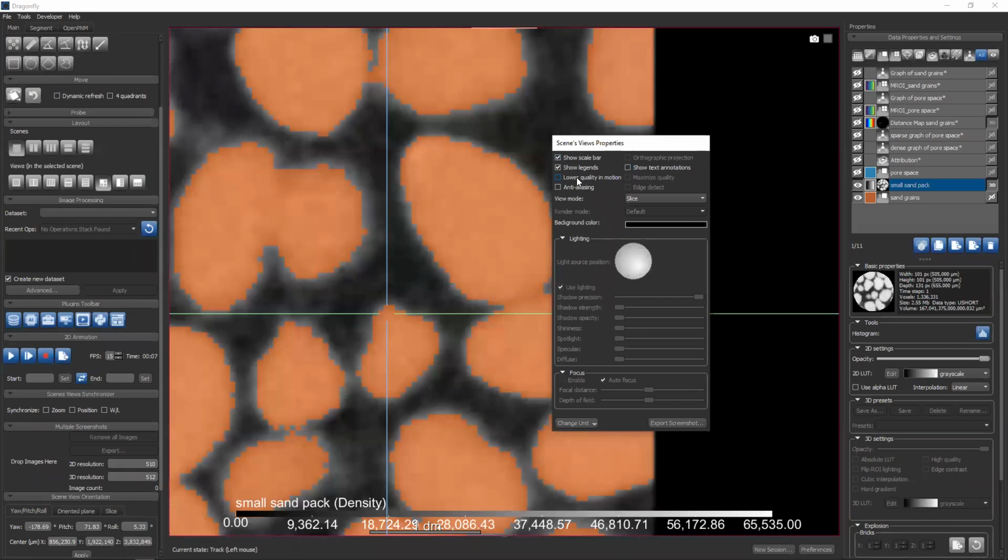Next question, can we export the processed data as text or CSV for replotting in Origin? I don't know what Origin is. The data can be exported as CSV, although I've been told there's a bug in Dragonfly 4.1, so you may have to wait till Dragonfly 2020.1. With any luck, you'll see that in this webinar series later this month when that download is available.